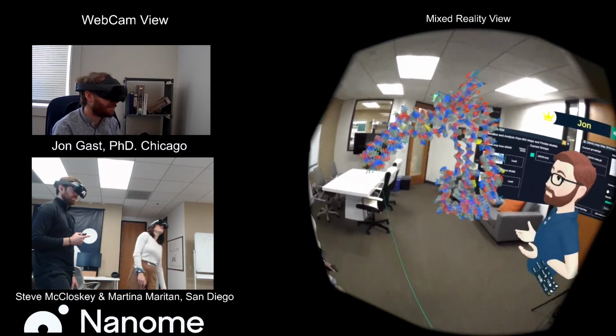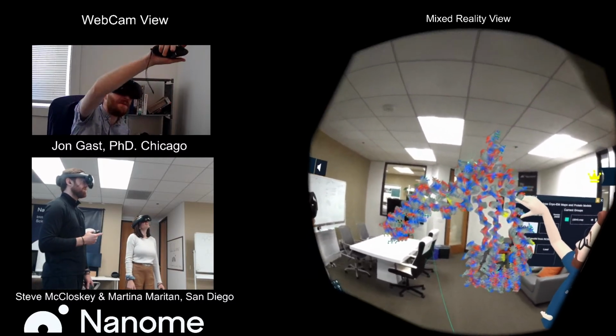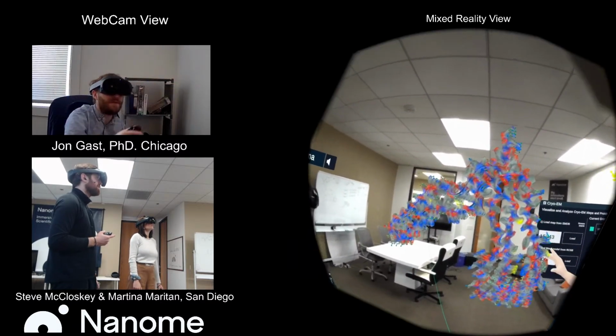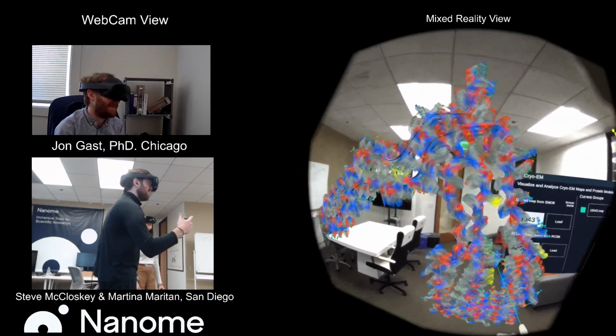For cryo, remarkable for cryo. Oh yeah. Well, and we can see just how we aren't even getting just the backbone here. We're getting really good fits for all the R groups. Yeah, there's a lot of controversy right now, right?